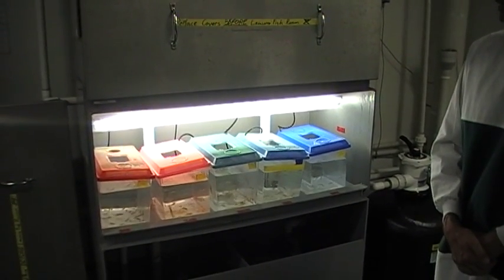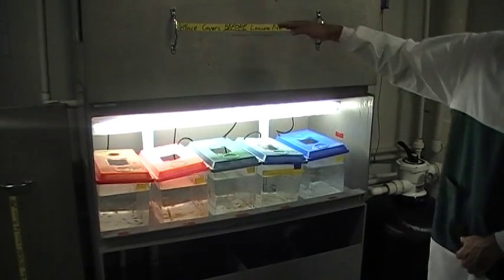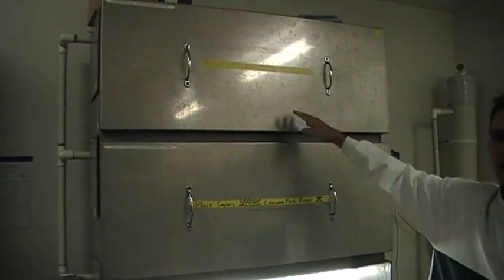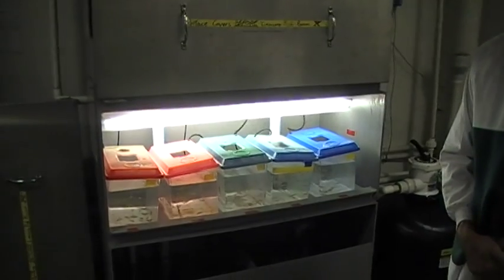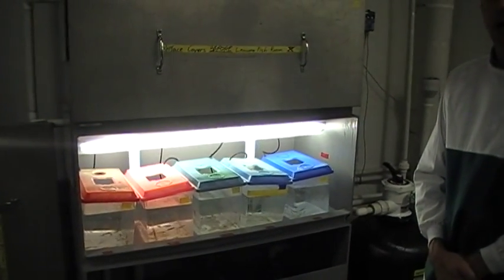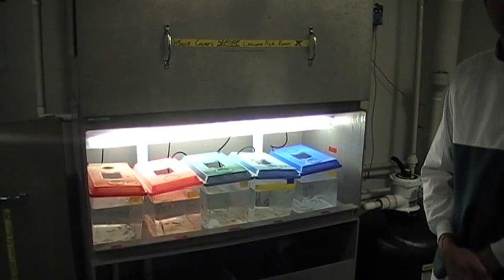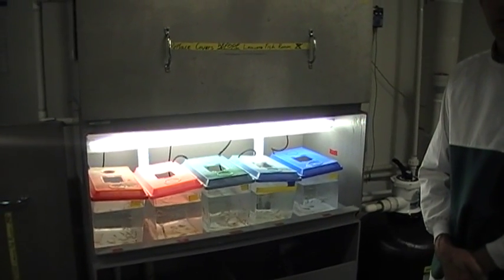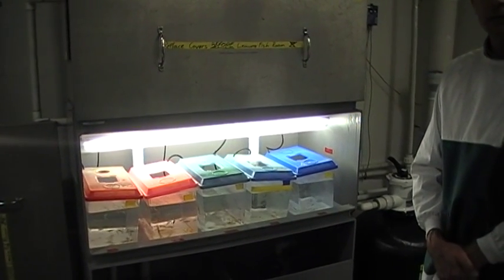So what we do is we have light chambers here, here and here with different daylight cycles so that the morning begins at different times and the eggs will be laid throughout the day so that we can inject them. So how do we get the eggs from the fish?